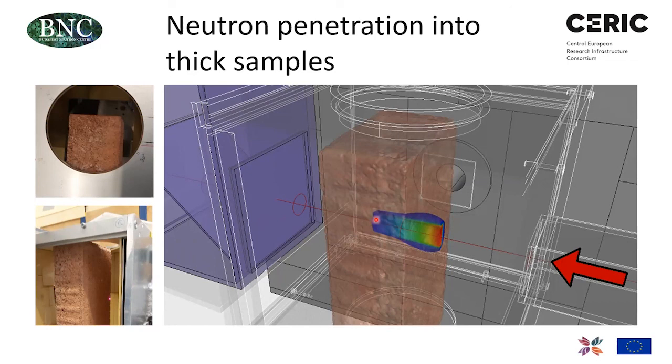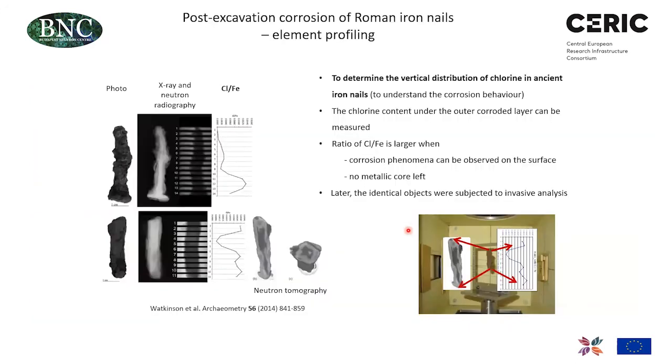And of course, gamma rays emitted from the backside of the sample have to travel through a longer path length towards the detector than this one, so they will be differently attenuated, and this can be quantitatively corrected for using these Monte Carlo techniques.